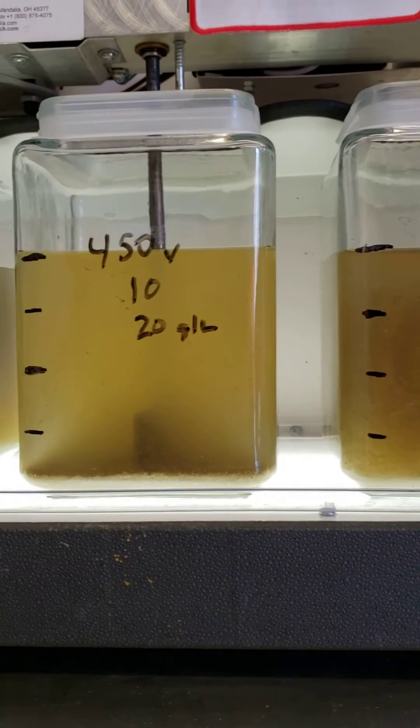So with sand, without sand. Turn the mixers on one more time. And that's off.